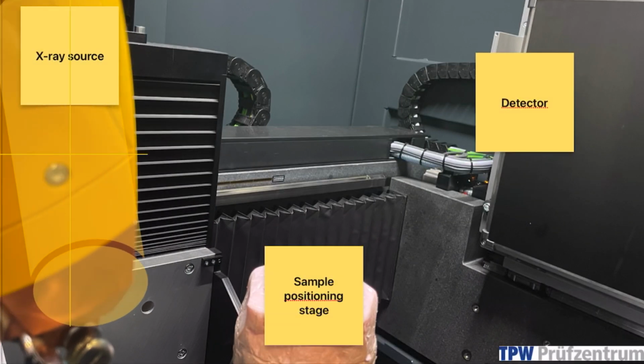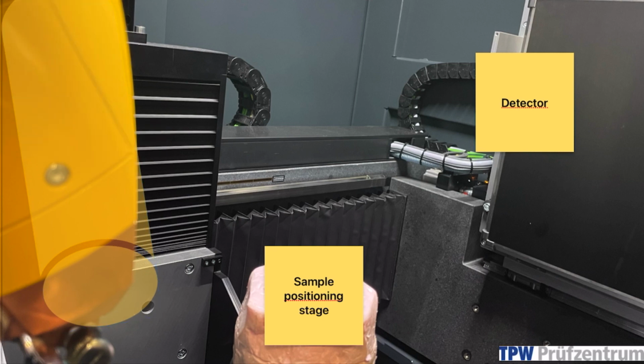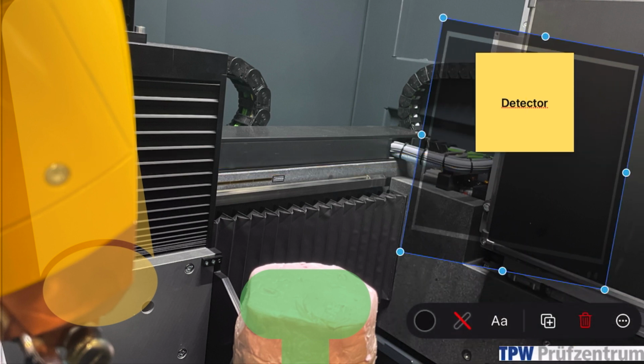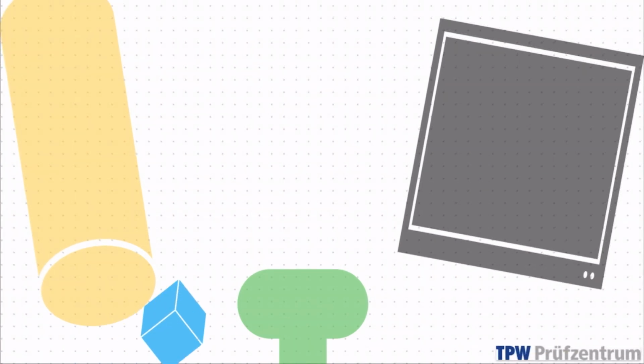For this video, I'd like to keep it simple. So I use this yellow cylinder for the X-ray source. This will be our sample positioning stage. And then I use a schematic black screen as a symbol for the detector. As a sample, I'm using this cube.